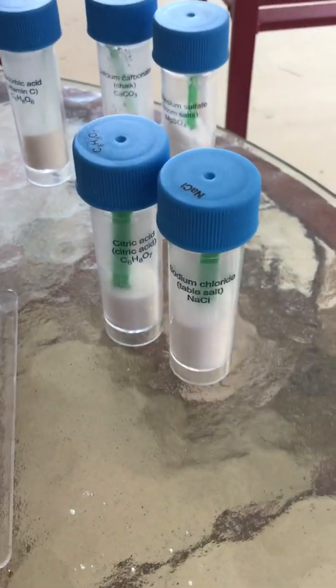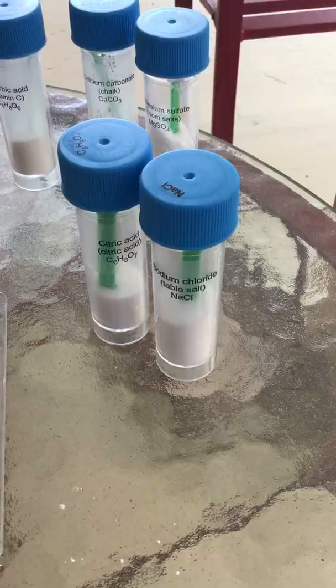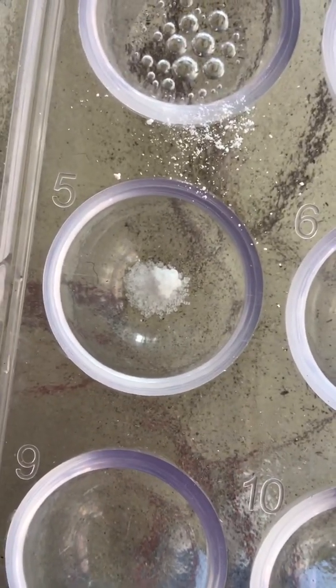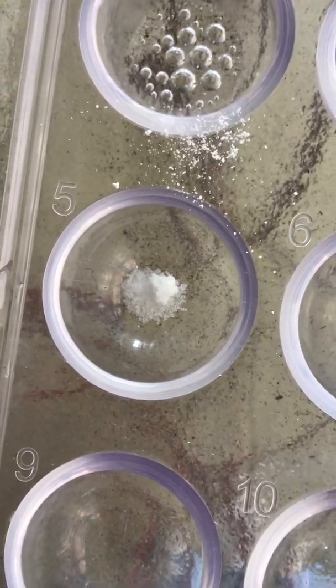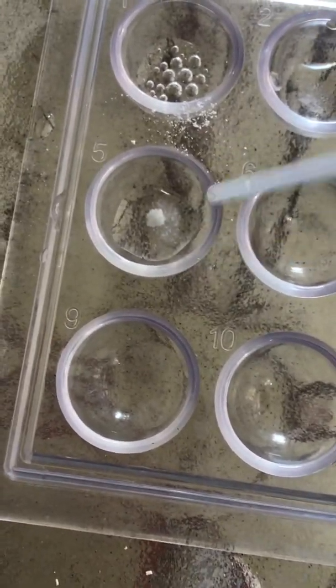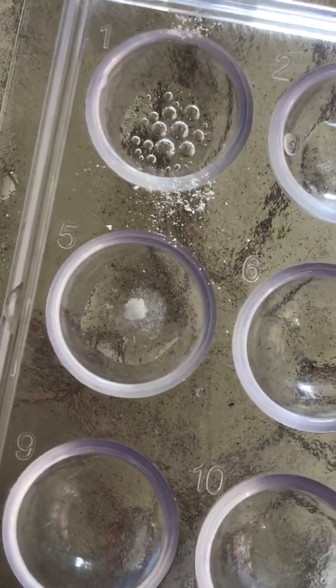In well five, I'm going to try citric acid and sodium chloride. Once again, crystal-like and clumpy powder. Let's see what happens when I add water. Doesn't really look like anything's happening.